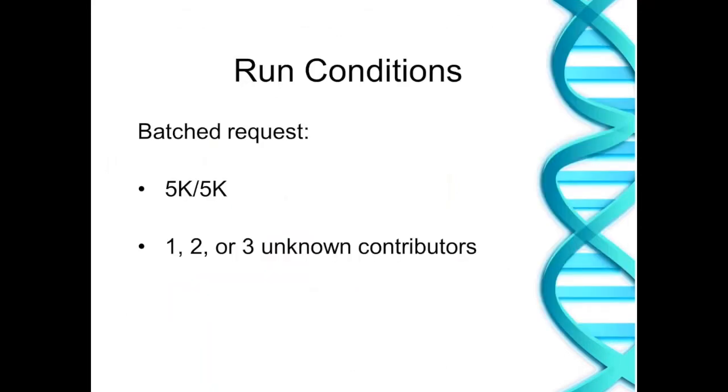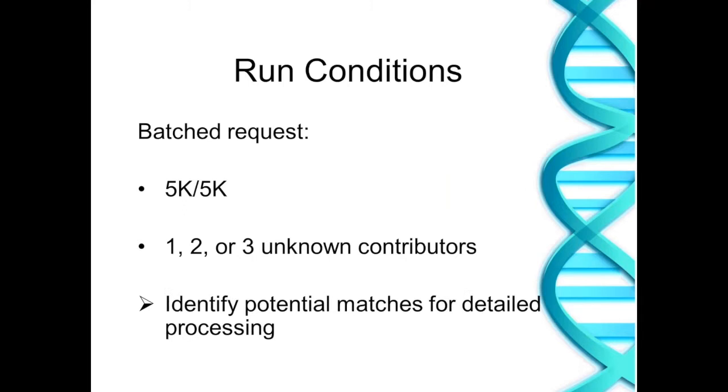But the run conditions are fine, because with this database workflow, we're not using this as a definitive solution. We're just looking for potential matches for further investigation. The way I think of it is similar to a presumptive test, right? We're using this as a presumptive test to sift through a lot of complex data and look for possible matches that we'll look at more in depth. Instead of spending a ton of human time trying to interpret every possible contributor that might be there and then comparing the knowns, we just let the computer do the heavy lifting and then tell us which samples warrant a closer look.